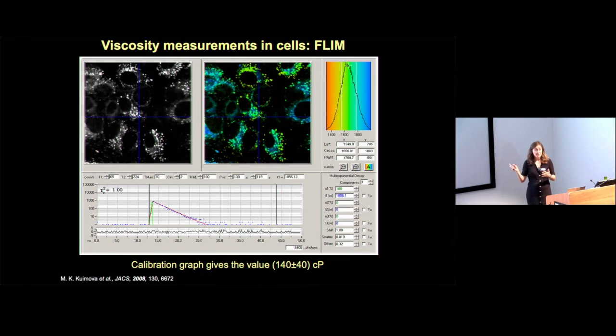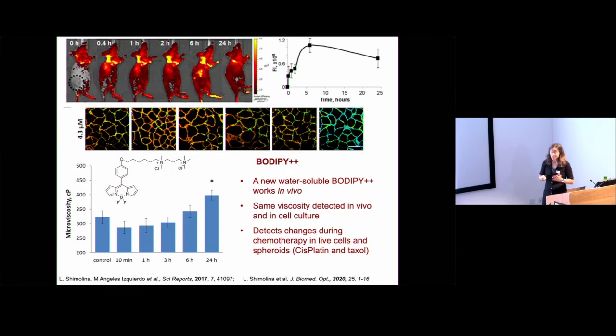So this was a good discovery for us now many years ago, but essentially we know that we are probing lipid-based domains where viscosities are 100 times higher than that of water, and diffusion-controlled processes are really slowed down compared to what will happen in water. Consequently, we design rotors that have positive charge at the end of their tail, and that acts as a stopper, and that prevents endocytosis of our dye inside the cells.